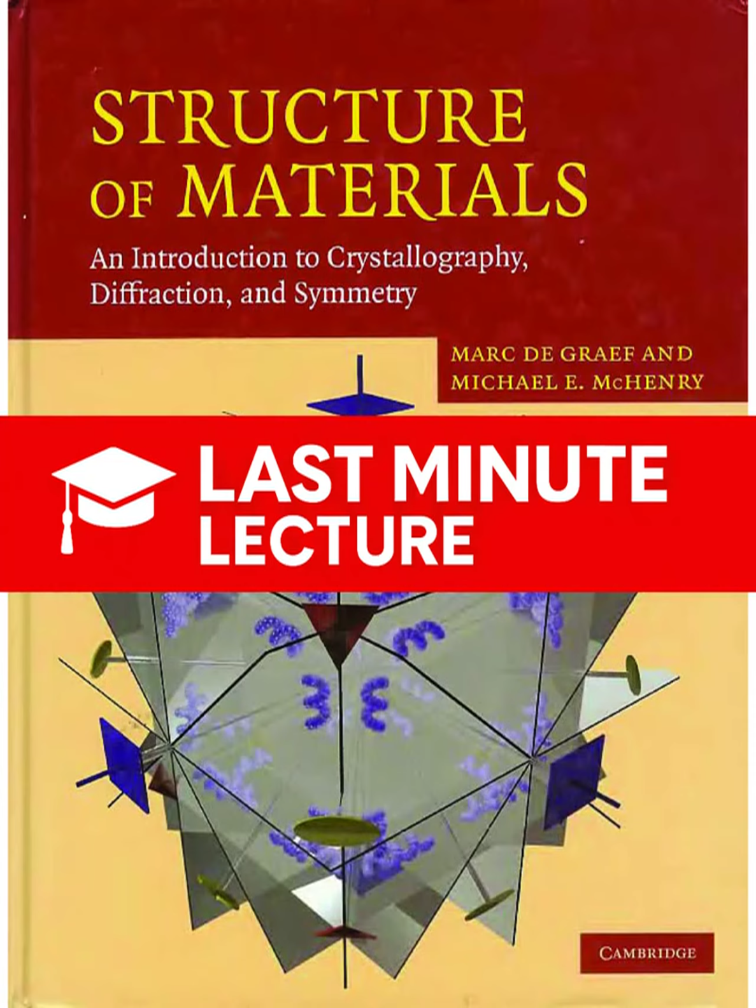That's right. μ is a linear absorption coefficient. We often standardize this by dividing by density, giving us the mass absorption coefficient μ/ρ, which depends only on the material and the wavelength. So this is where the physics of the absorbing material becomes our filter. Yes. If you plot that mass absorption coefficient against wavelength, you see a general trend. Shorter wavelengths, which are higher energy, are absorbed less. But then all of a sudden, there is a dramatic, sharp spike, a discontinuity. We call it the K-absorption edge.